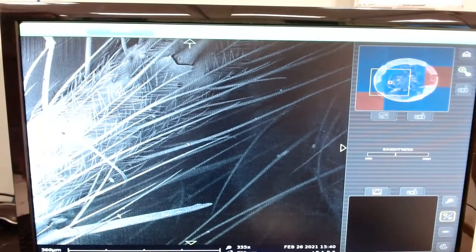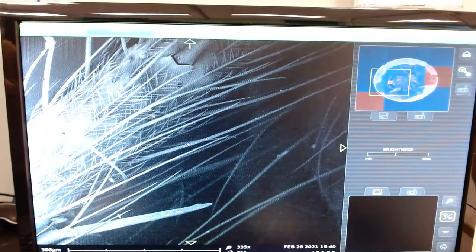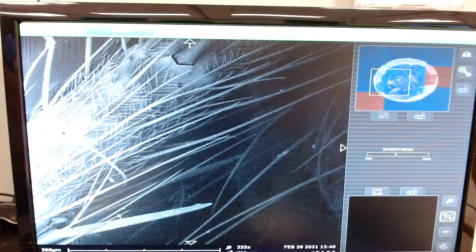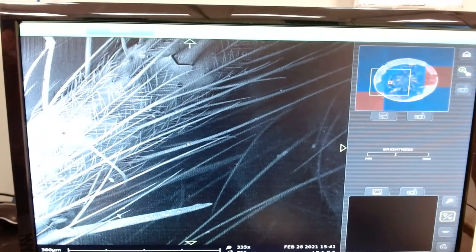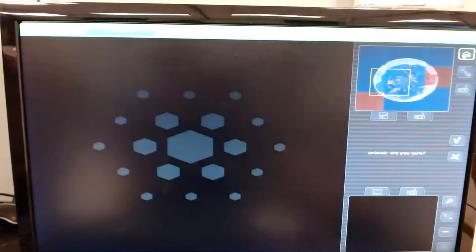Okay. Well, look at that. First things first. How about you have a seat and then I'll just let you do anything? I've actually used the Phenom before. I used it for imaging algae diatoms in Schneep's lab. Oh, right. Do you need help adjusting that one? Okay. So at the top right corner? That's it. It's been a little bit since. And then it'll ask you, are you sure?